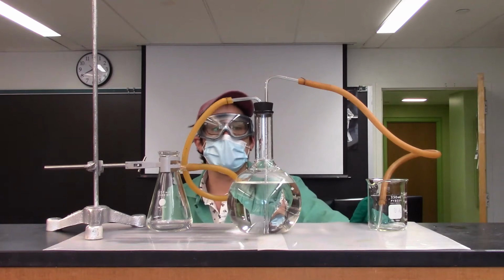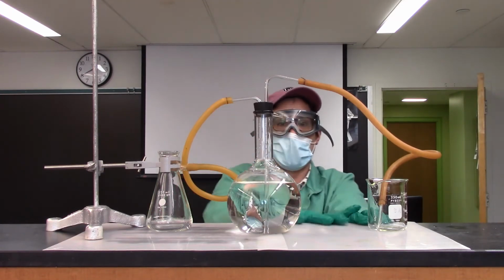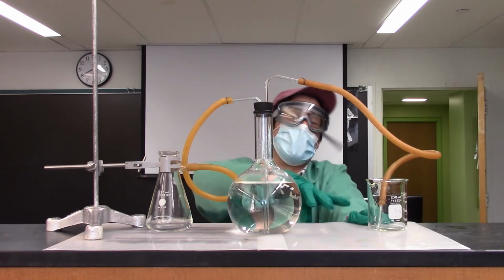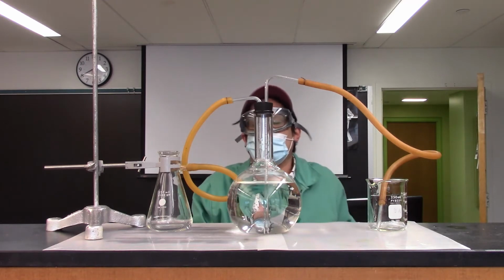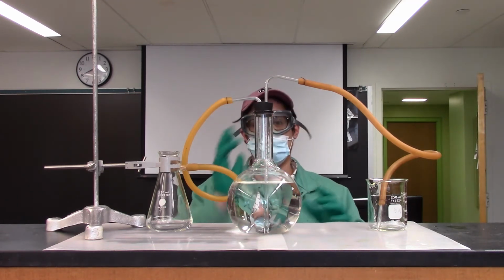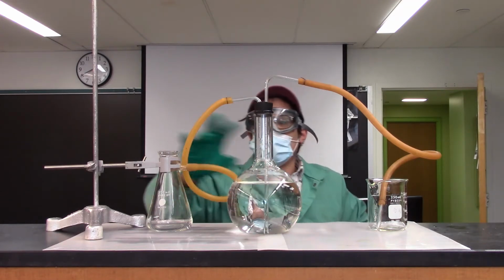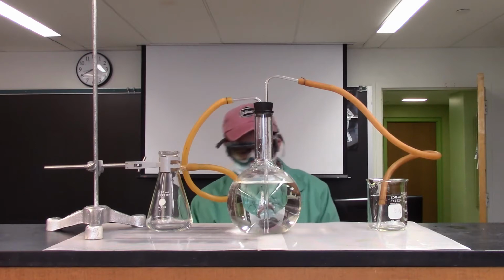We'll be pre-weighing our beakers in order to do this so we can get the mass of the water that's displaced. By looking at density, we can figure out the volume of the water that was displaced. The volume of water will be equal to that of the hydrogen gas, which is pretty nifty.